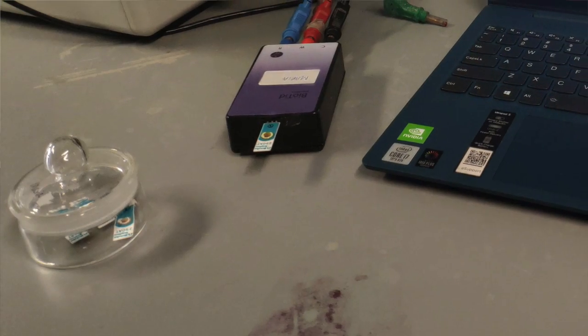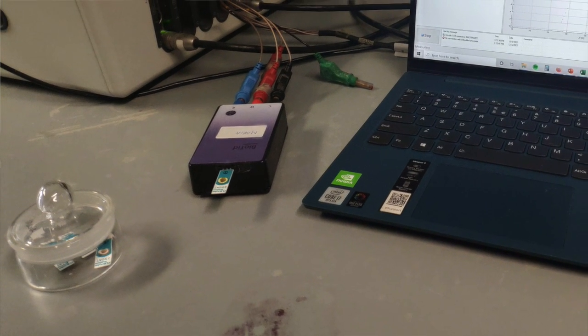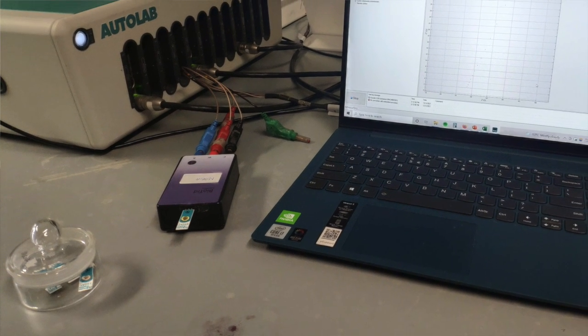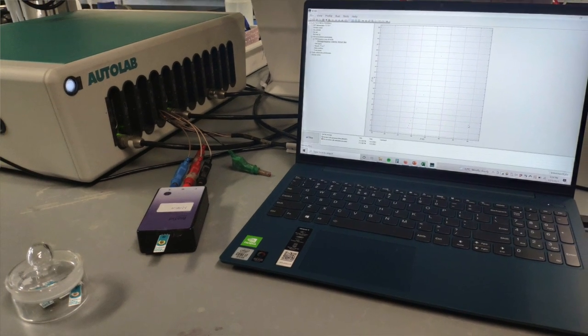And then in the lab, to validate and see whether it actually has affinity for these proteins, I just dunked a whole lot of the protein on top of the sensor. Before and after this process, so before dunking the proteins I'm trying to detect, I measured the signal. So if there's a major change in the signal before and after, you can, in very simple terms, conclude that my sensor works because there is a change in the signal. Of course, it's more complicated than this and nothing works perfectly, but this is just to understand the principle of how it works.